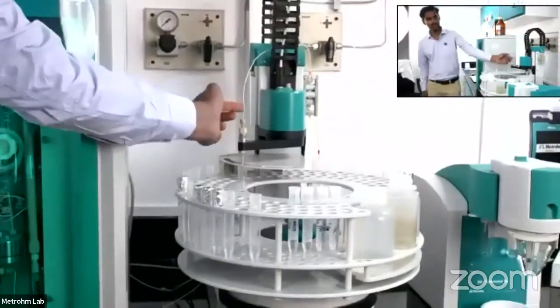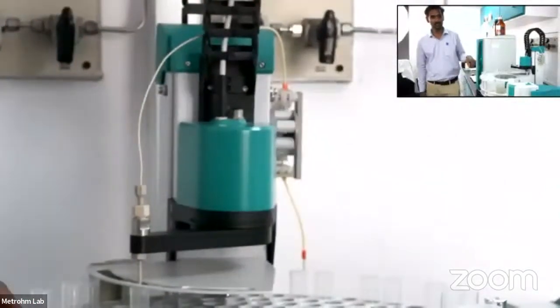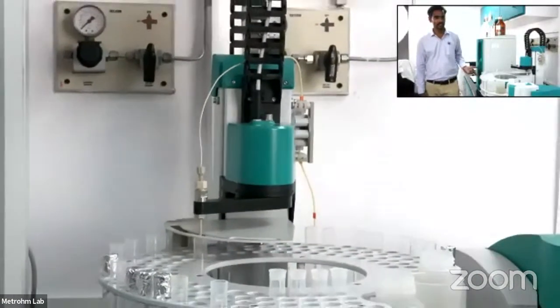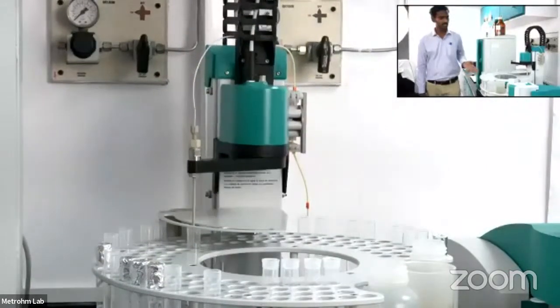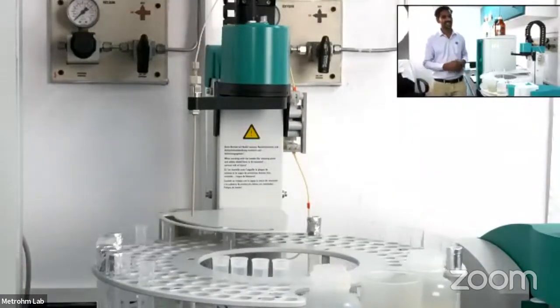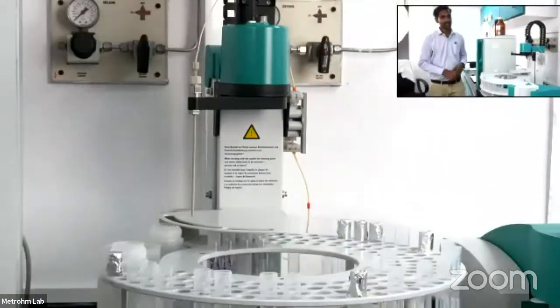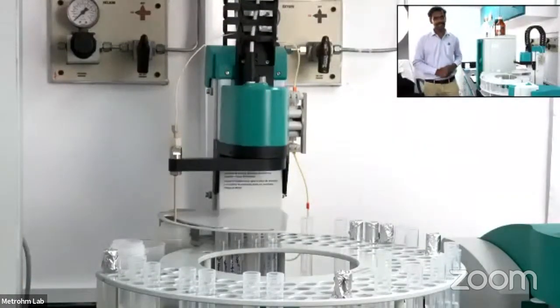Okay, so it is going this way, and this is the peristaltic pump. It is sucking the solution from the water sample. Once the solution is transferred to the IC system, the loop gets filled, then it goes for the injection. Once the injection is done, it goes to rinsing. The flow path, everything, is rinsed by the ultra pure water. The ultra pure water we kept in this. It takes the ultra pure water and cleans the line, and it is ready for the next injection.